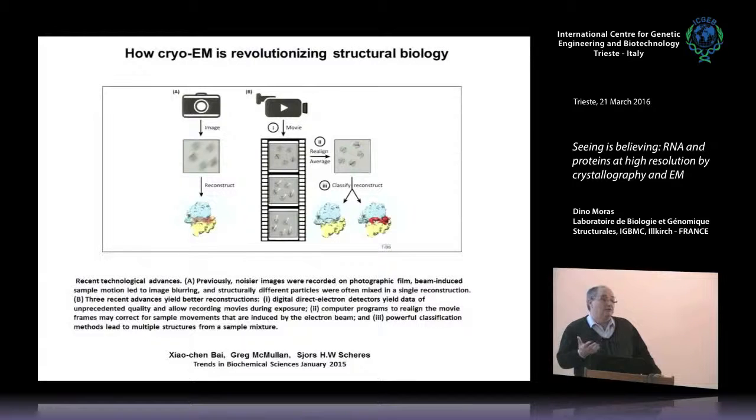another technique emerged, which is a very old technique, cryo-EM, electron microscopy. Electron microscopy was used until 3 or 4 years ago to provide information on large complexes. That was its advantage. It could not be used for small enzymes, only large molecules. But the resolution was limited to a medium average at best. That is 7, 8 angstroms, that was the limit, more often between 10 and 15. So you could get some information, but not molecular level information.